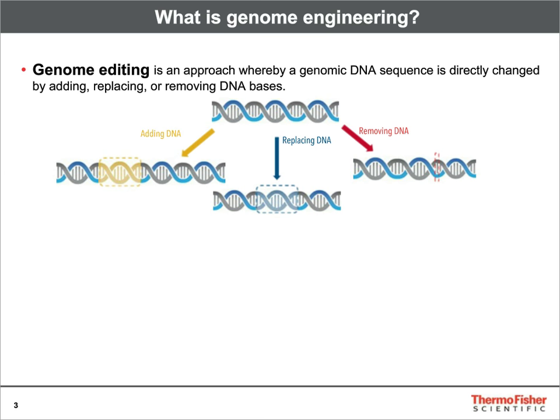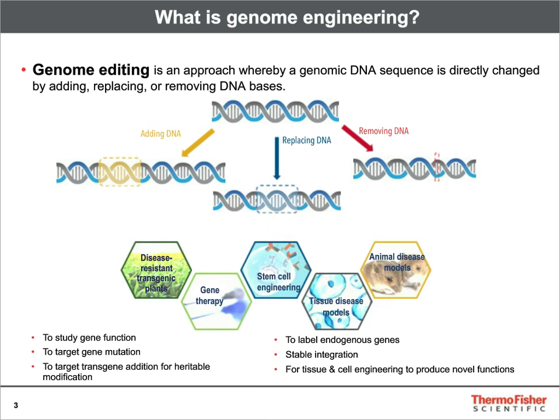Let's look at what genome editing is. It's an approach whereby a genomic DNA sequence within a gene in a cell type of interest can be directly changed by adding a new piece of DNA sequence, or replacing or removing DNA bases. If you look at the different applications of genome editing, one could use this for very basic studies like studying a gene function. You can knock down a gene by removing DNA bases, or you can revert a gene mutation in a disease phenotype to a wild-type phenotype. You could also do more sophisticated applications like tagging an endogenous gene with reporter genes or a promoter of your choice, for example, an inducible promoter. One could also use this for engineering the cells and thereafter use it in tissue engineering or model system generation.